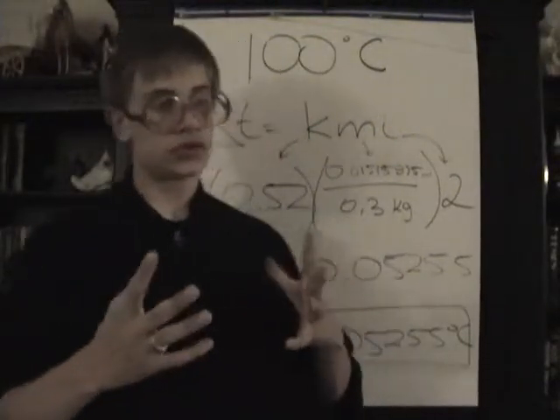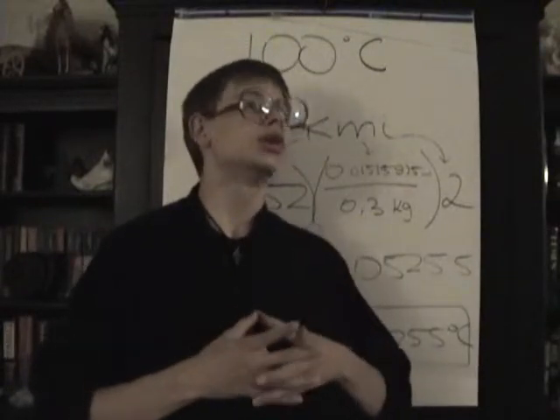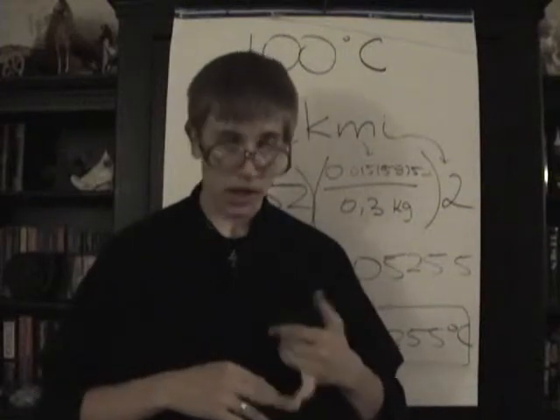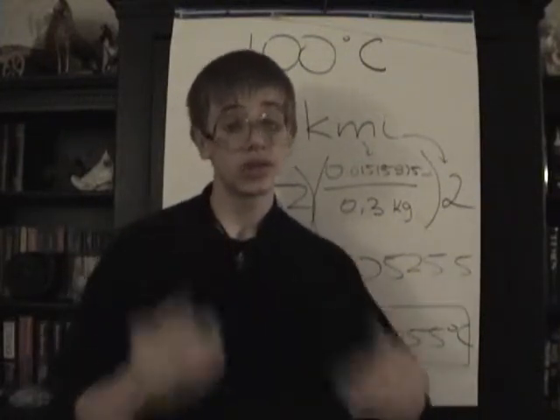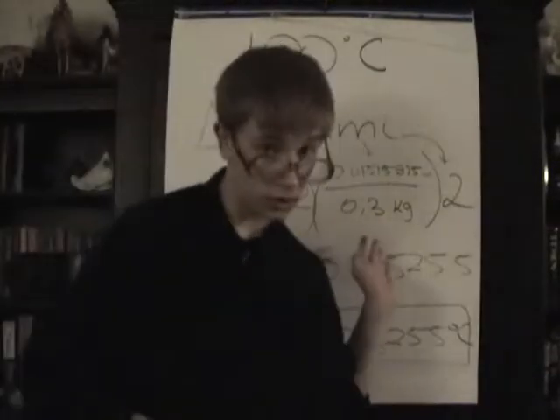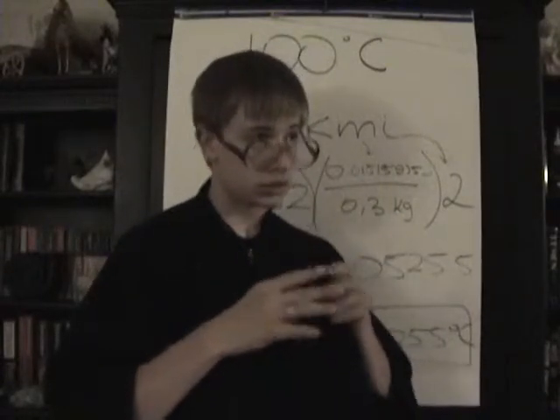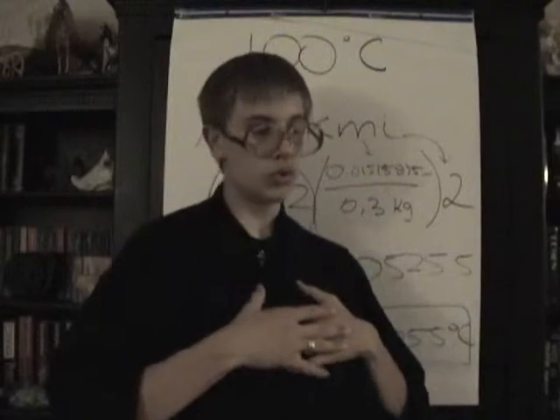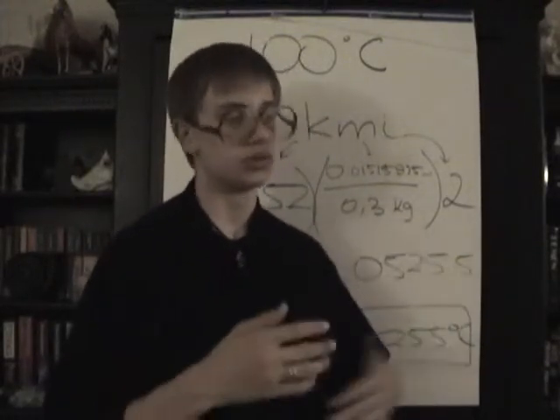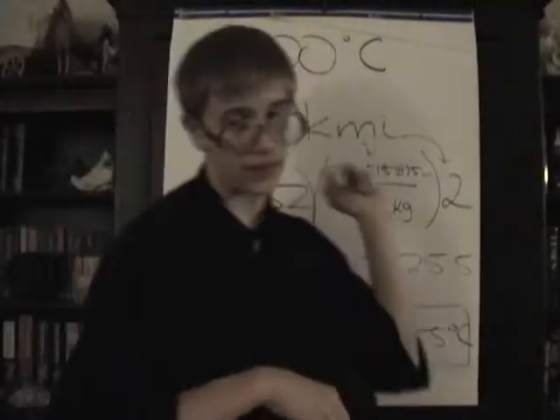After we finish freezing the solutions, which is in process right now, we will then boil the solution and get the temperature, and we will repeat the experiment 2 more times, so we have 3 sets of data to compare to the mathematical formulas. Of course, humans make errors, and there are also mechanical errors. So we will also determine the percent error, and hopefully it is within a reasonable margin, so we can safely say and prove that colligative properties are in fact true.